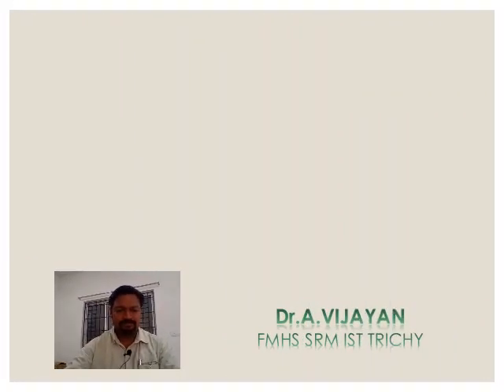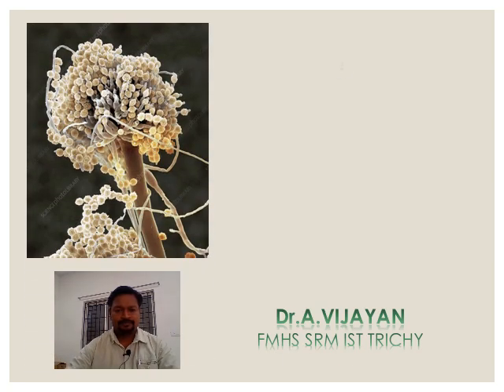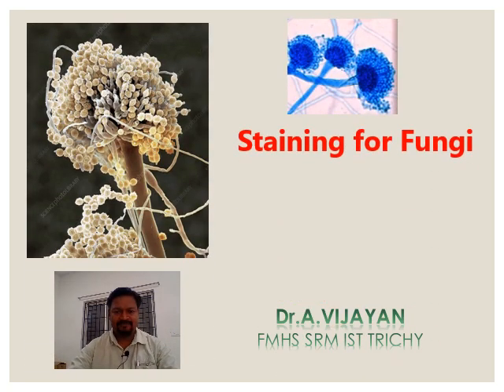Very good morning. I am Dr. Vijayan, SRMIST, Tiruchirappalli. Today we will discuss lactophenol cotton blue staining for fungus.